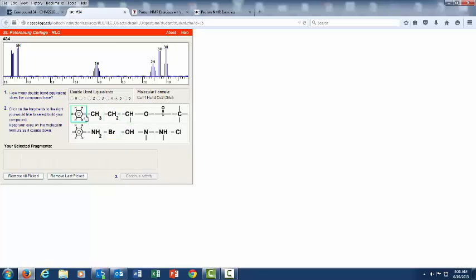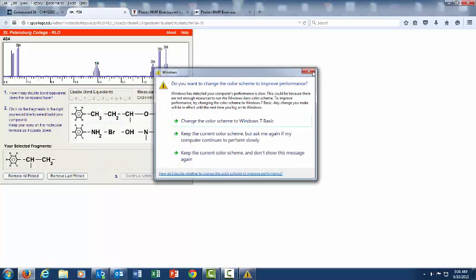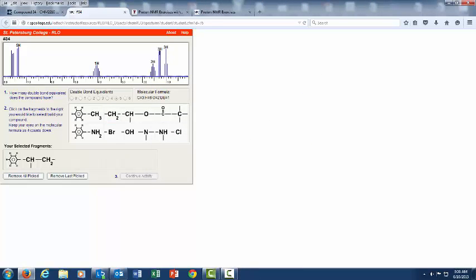So there are 5 double bond equivalents present. Once you do that, you can see all of these choices come up for the pieces that we see in the spectrum. Over here we have a 5H. This would be an aromatic ring with 5 hydrogens on it. Over here we have a 1H, and since it's a multiple peak, it's going to be a CH. Over here we have a 2H, again a multiple peak, so it's going to be a CH2. This here is a 3H, that's going to be a CH3, and another 3H, that's going to be a CH3 as well.